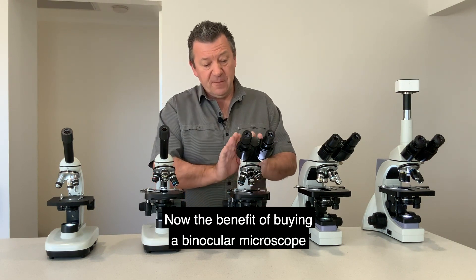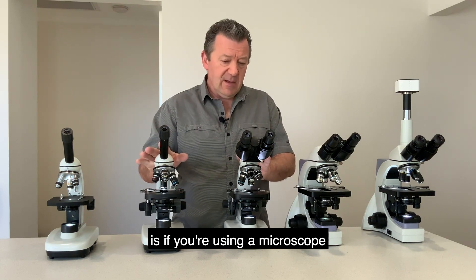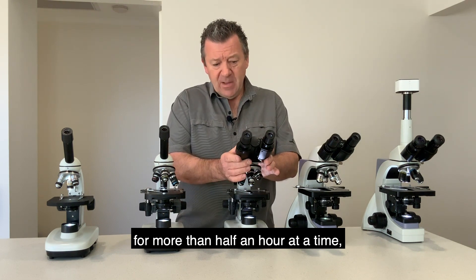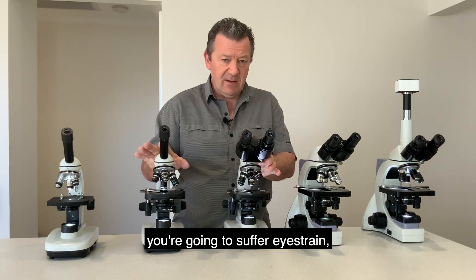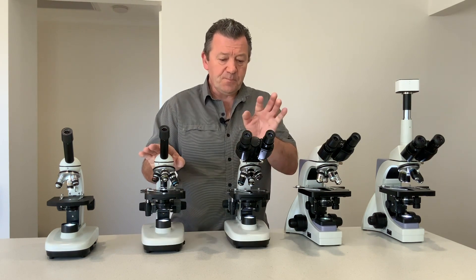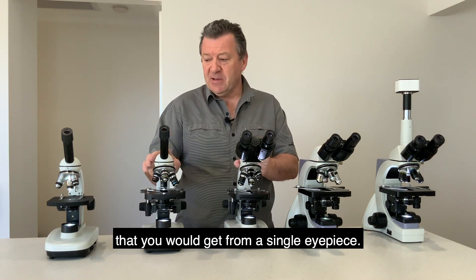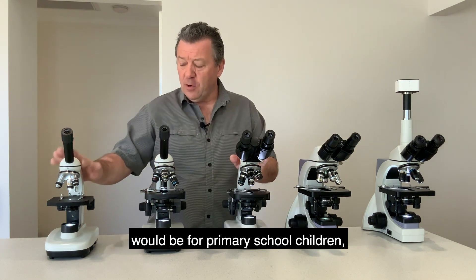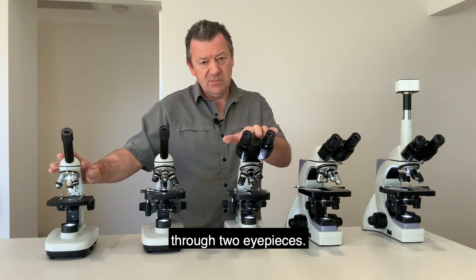The benefit of buying a binocular microscope over a monocular is if you're using a microscope for more than half an hour at a time with a monocular eyepiece you'll suffer eye strain and headaches, whereas with the binocular head you don't get the eye fatigue. The only time we'd recommend a single eye tube is for primary school children who sometimes find difficulty focusing through two eyepieces.